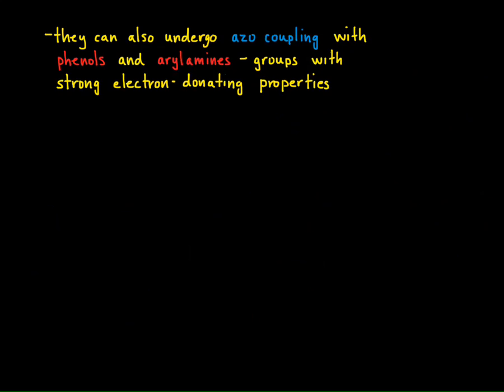The electrophilic nature of diazonium salts is not limited to the benzene ring. Highly activating benzene derivatives, such as phenols and arylamines with strong electron donating properties, can undergo electrophilic aromatic substitution with diazonium salts.